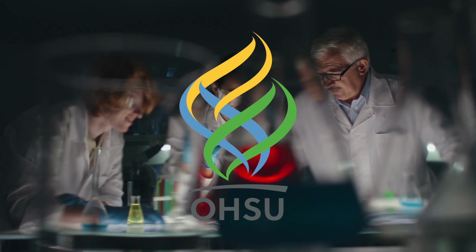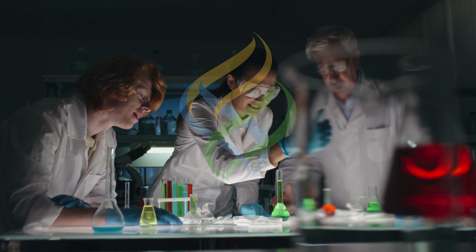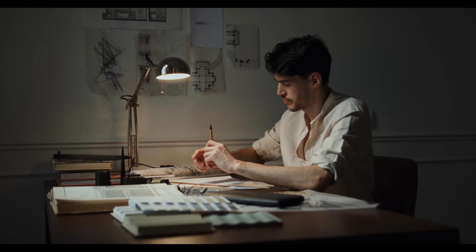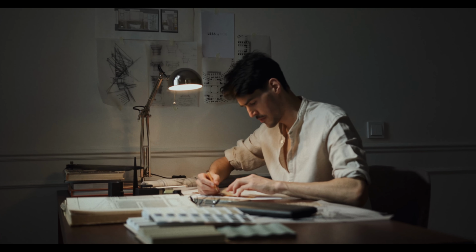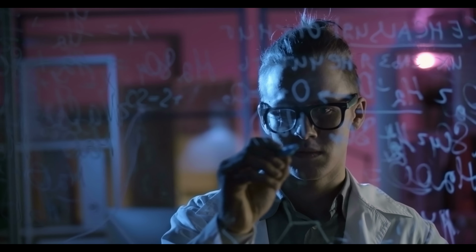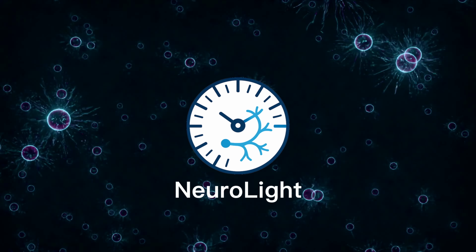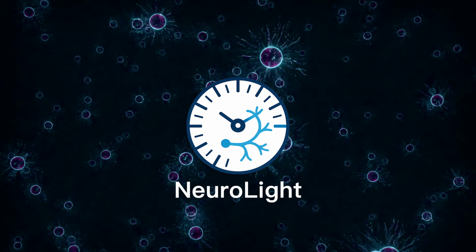Dr. Allen's lab at Oregon Health Sciences University spends countless hours on this tedious process. Their current method of tracking is error-prone, limits experiment scale, and worst of all, delays critical discoveries. Researchers waste time on repetitive data processing instead of the actual science to help people. Meet Neurolight, intelligent automation for neuronal image analysis.